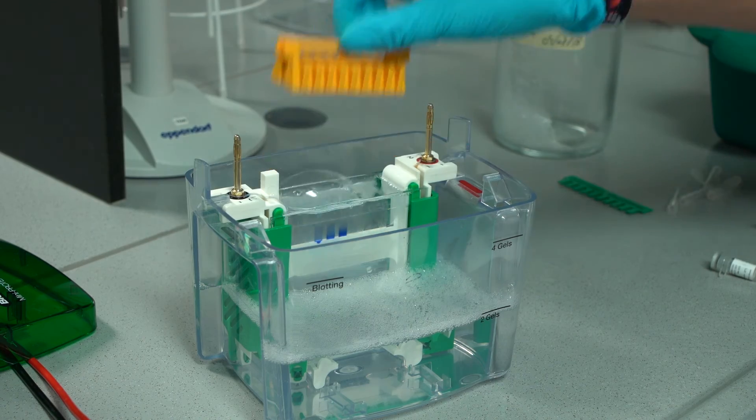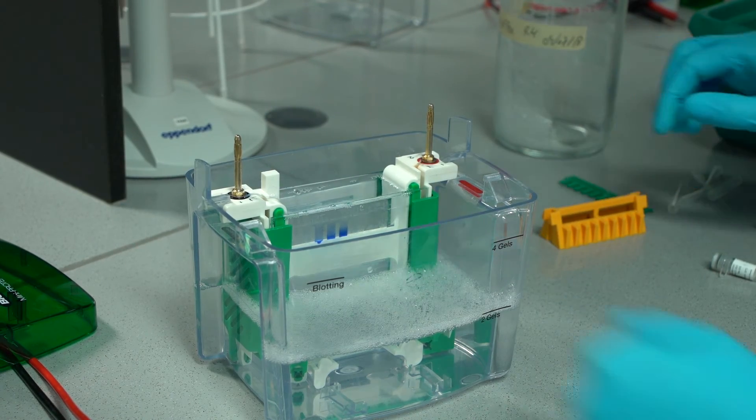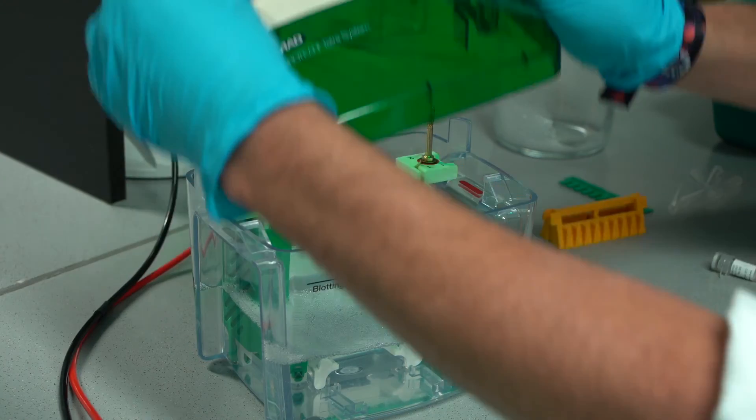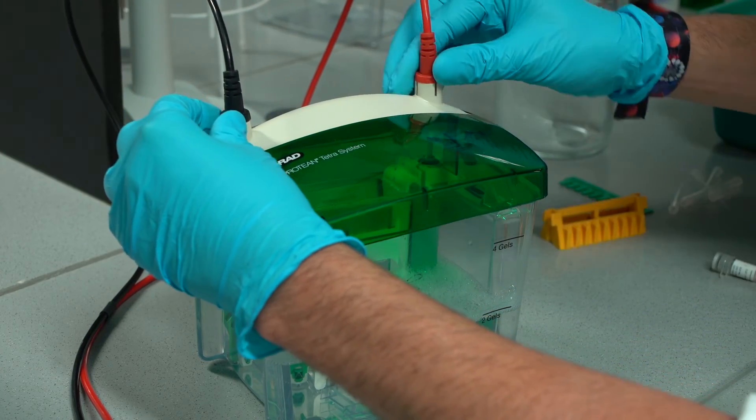When everything is loaded onto the gel, the lid is put on the tray. Ensure that the correct poles touch each other: black on black and red on red.